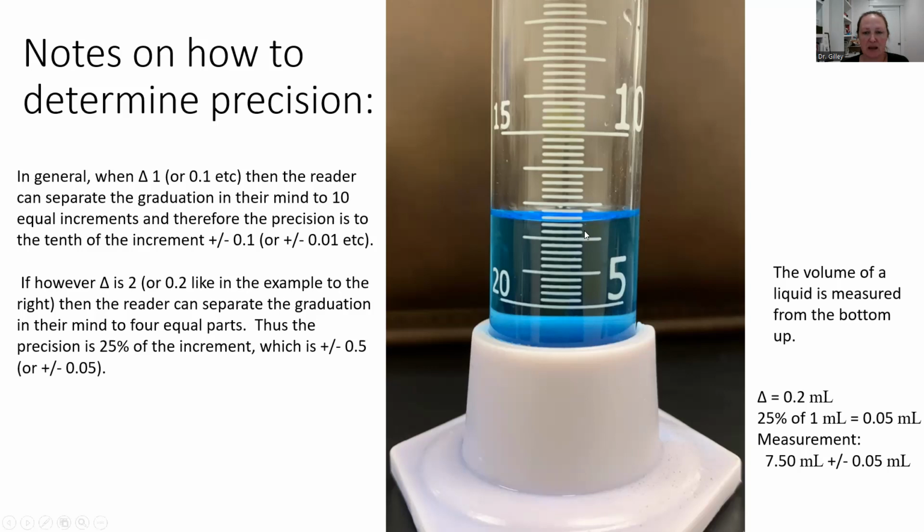So again, because it's 0.2 in here, we can't really get as fine precision. So we're a little bit more uncertain, more like 25% of that 0.2 instead of the 10% we had before when our graduations were at 0.1.